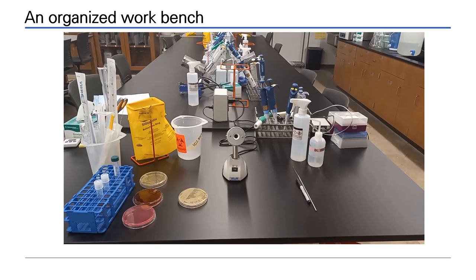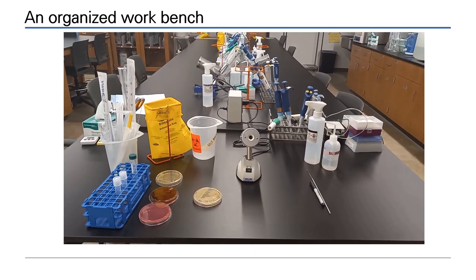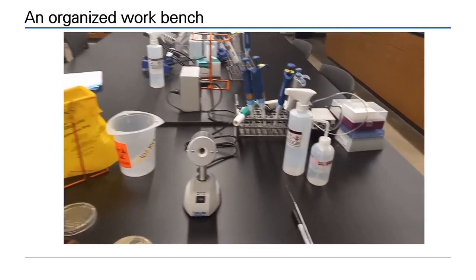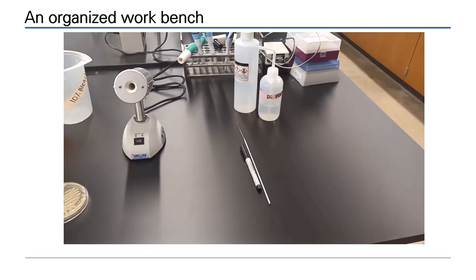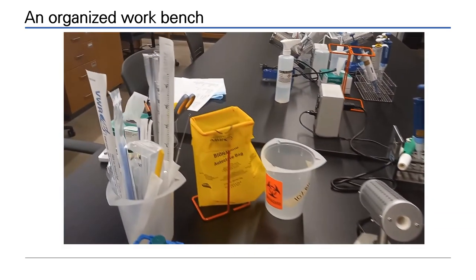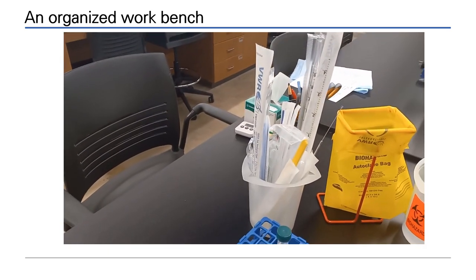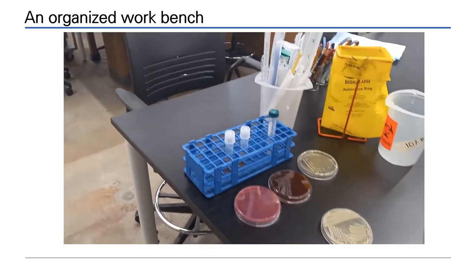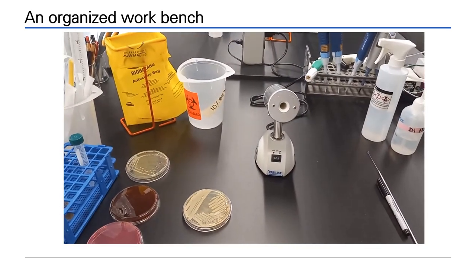The microbiology workstation must be well organized. The vaccinerator sits in the center. Ethanol, inoculating loops, and pens sit to the right with your dominant hand. Waste is off to the left. Additional equipment and lab cultures will also sit on the left. The area should remain tidy at all times.